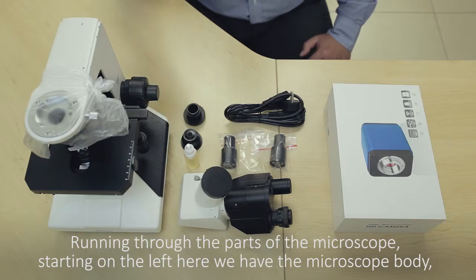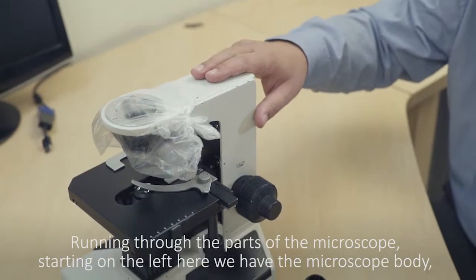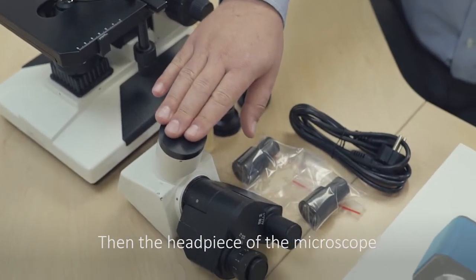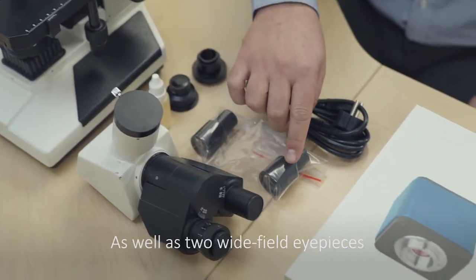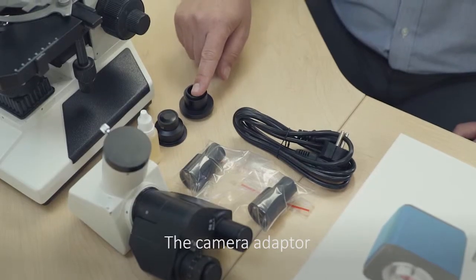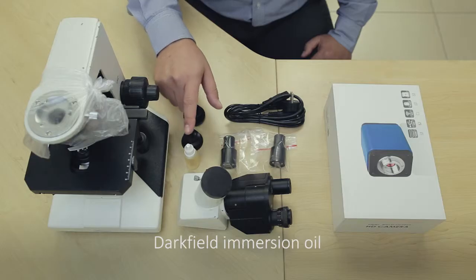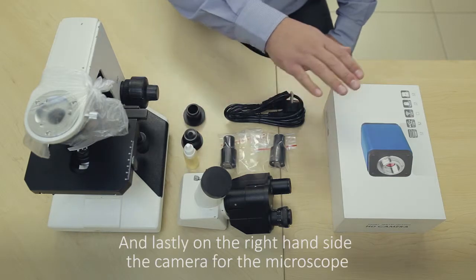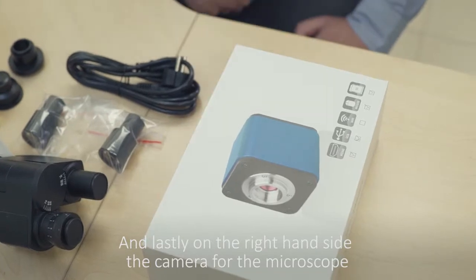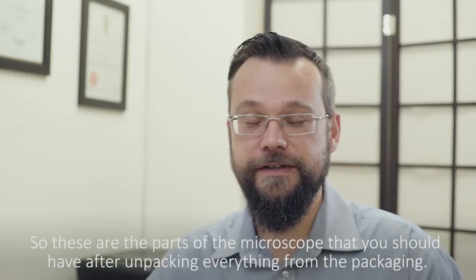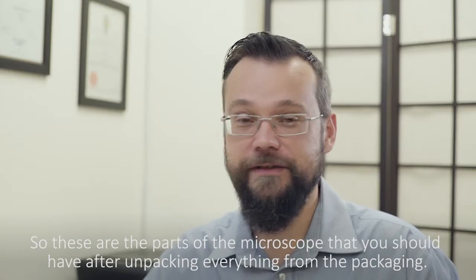Running through the parts of the microscope, starting on the left here we have the microscope body, then the head piece of the microscope, as well as two wide field eyepieces, the power supply cable for the microscope, the camera adapter, darkfield condenser, darkfield immersion oil, and lastly on the right hand side here the camera for the microscope. These are the parts of the microscope that you should have after unpacking everything from the packaging.